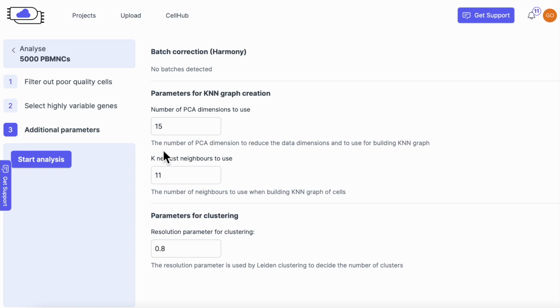We next try to find which cells are most similar to each other. The default value for KNNs of 11 means that we try to find the 11 cells that are most closely related and form a graph with these. To choose this number, consider the probable size of your smallest cluster. If this is, let's say, 20 cells, and you have a KNN of 30, you will get false neighbors. Pick a KNN that is lower than your smallest cluster cell number. A value of at least 10 is usually good. In very large-scale experiments, the cells are often sparse in depth, and then you need a higher number, like 20 or 21, to get true clusters.